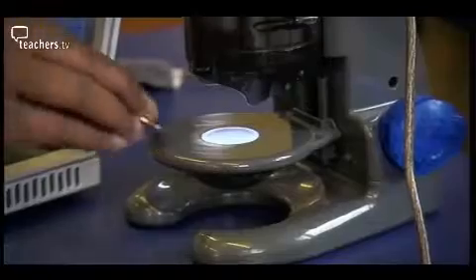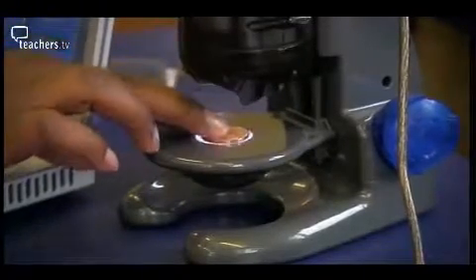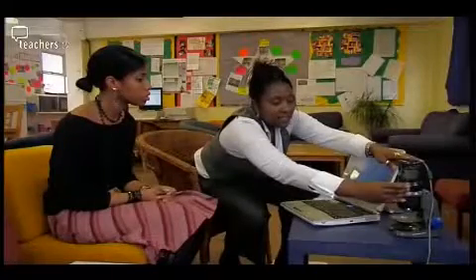I'm just going to put something under the microscope for you to have a look at so that it kind of makes a little bit more sense. Right. 2p. I am going to just adjust it to the lowest setting, which is 10 times magnification.